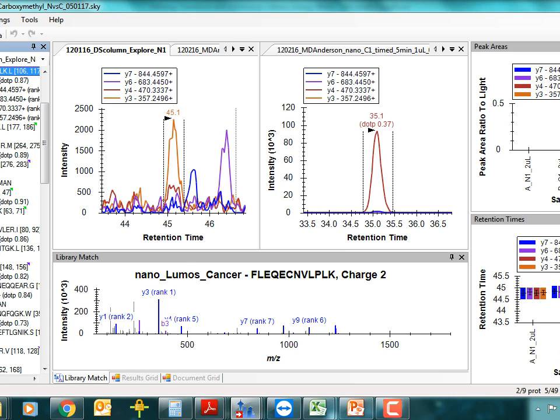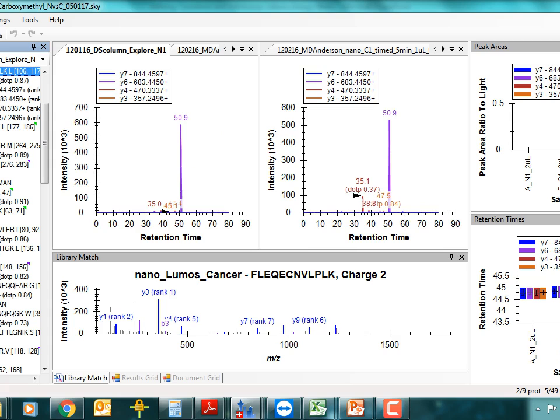Okay. So here are some little ways to navigate in Skyline that I find to be very helpful. Right now, Skyline is set up to zoom in on these peaks because they've been picked, and it wants you to see them nice and clearly. But I want to see the entire gradient. I want to see the entire chromatogram. So if you hit Shift F11, it should zoom out.